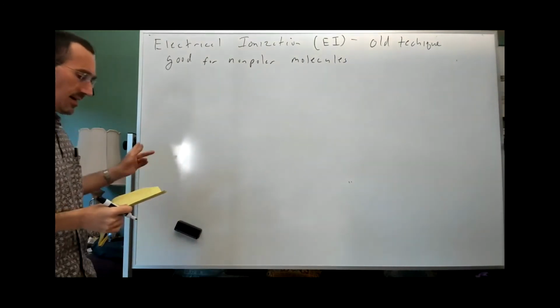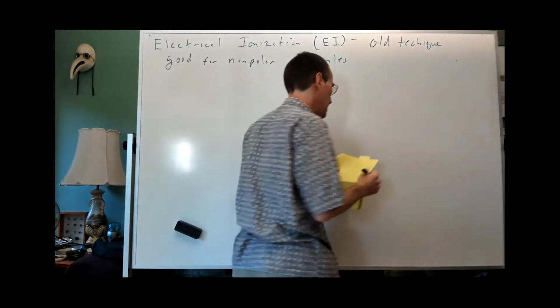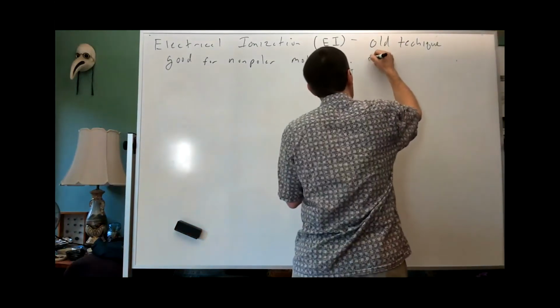And I'll say it's also good for smaller molecules and those without polar functional groups.